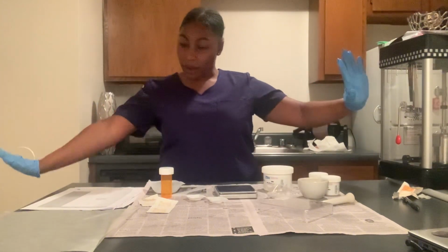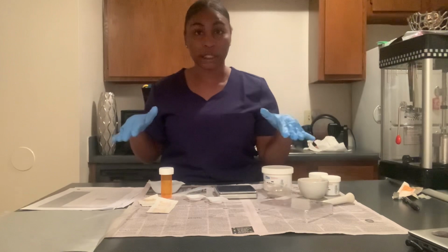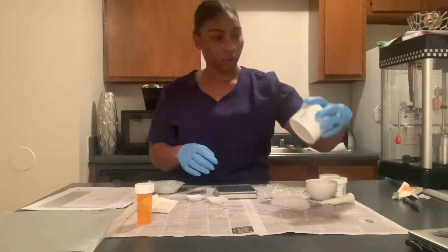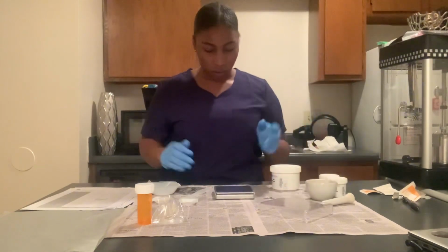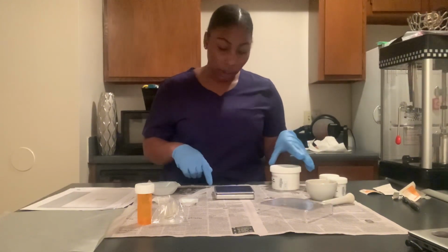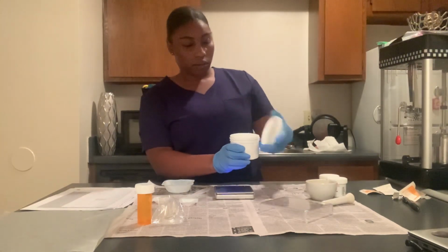Now step 6, we're weighing the ingredients, which are Symbase, caffeine, and then ergotamine, the things that we weighed and calculated in the beginning. I'm going to turn my scale on, and then I'm going to tare it so it goes to 0. It needs to be at 0 every time you're weighing. So we're going to grab our Symbase powder, which would be 5.4 grams is what we need.